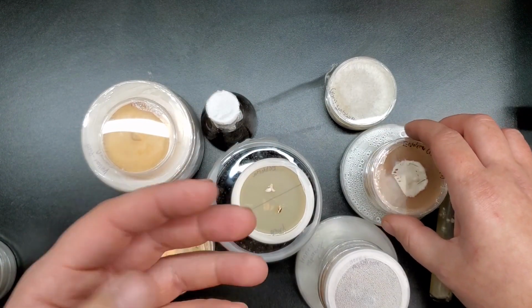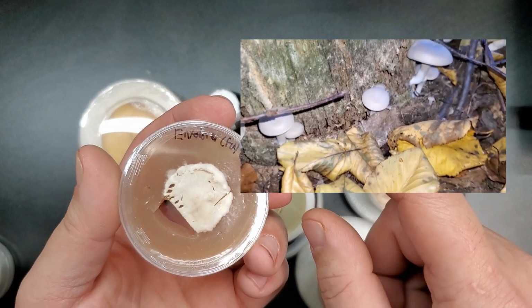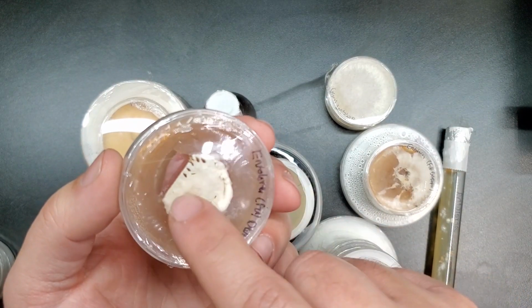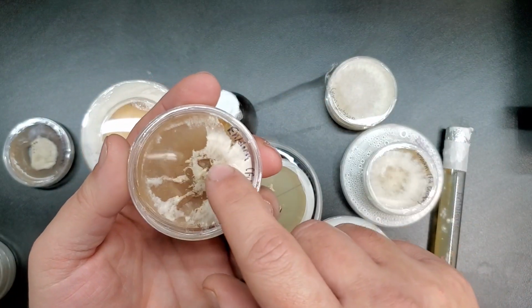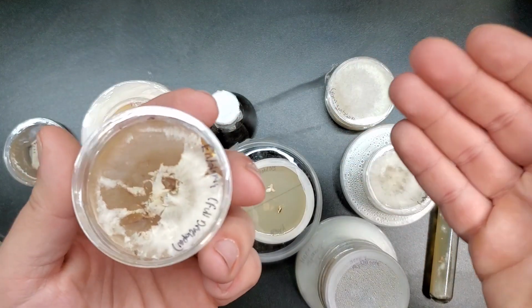First of all, we'll just go to this stack of petri dishes right here. Here is one of the original petri dishes that I inoculated with the fully formed fruit body of the Entoloma abortivum. And you can see that I've been using this to take quite a few tissue samples for inoculating onto other culture plates. Here's another one. Same deal. I used this one to inoculate quite a few culture plates and different grow media and different substrate to see what it liked to grow best on.